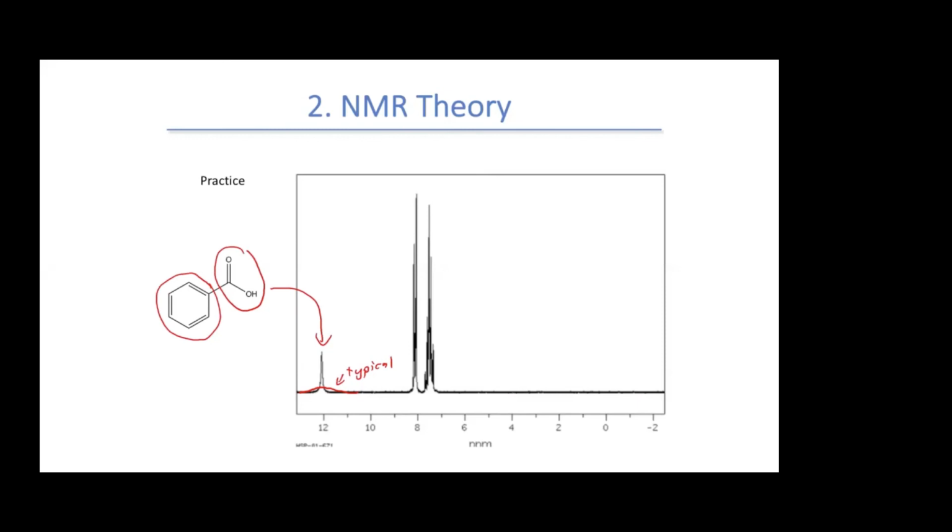And then finally, we look for the aromatic ring. We can see we have peaks between 7 and a little bit above 8. Like I said before, if it's a little outside the typical region, that's okay. It's very difficult to identify which one of these peaks corresponds to which hydrogens on the ring, so we can just say the ring is going to be both of those peaks. Now you should be able to identify the peaks in your main areas of your spectra and determine which functional groups are associated with those peaks. You should also be able to start identifying which CH groups are which peaks in your NMR spectra.